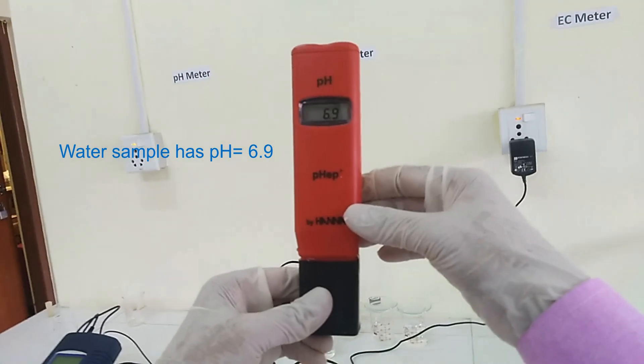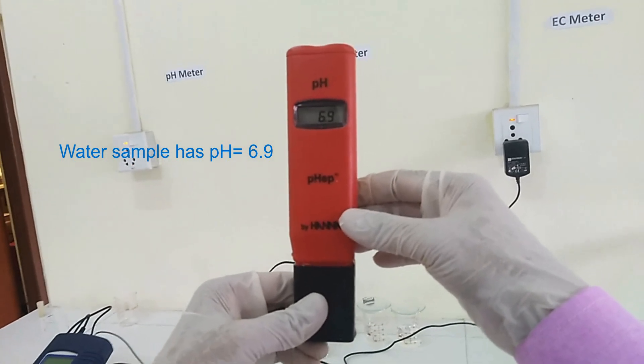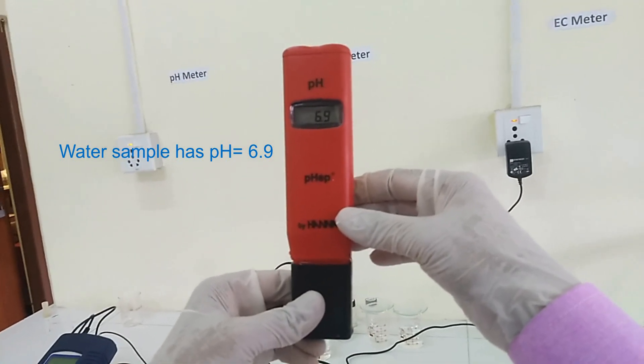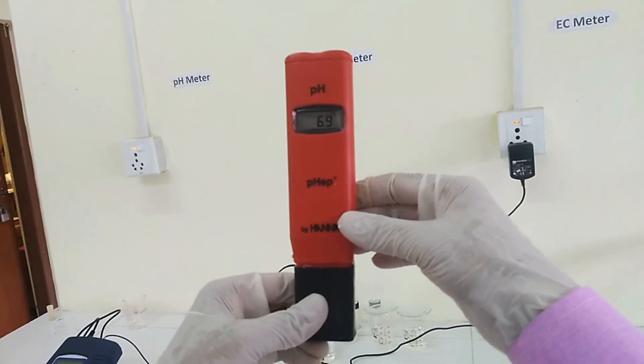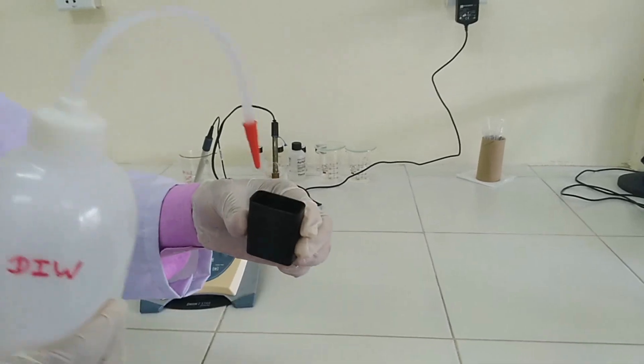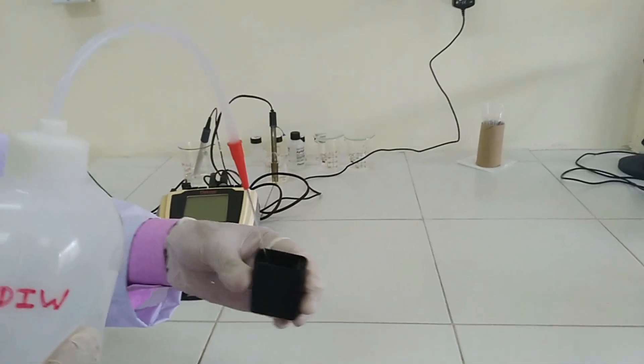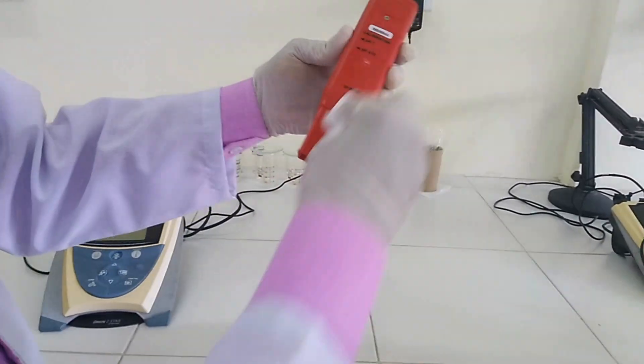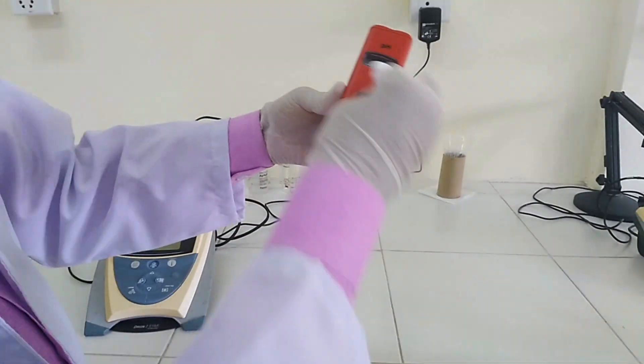In this case it was found to be 6.9. After measurement switch off the instrument and again rinse with the deionized water and make it dry. Always rinse the pH meter and cap before and after each measurement.